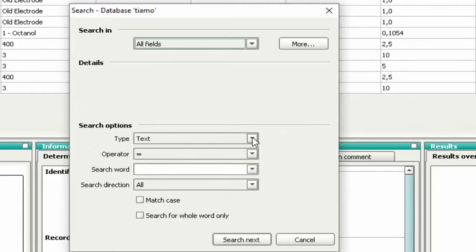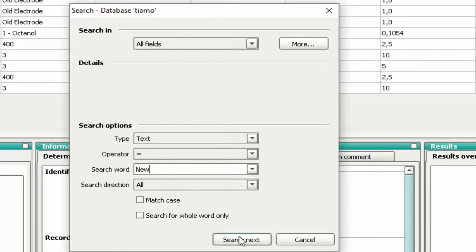Here, we show two examples, starting with text. Let's search the word 'New' and press the button Search Next.